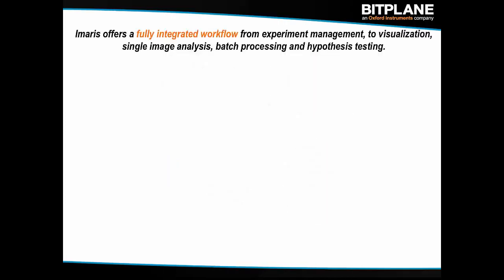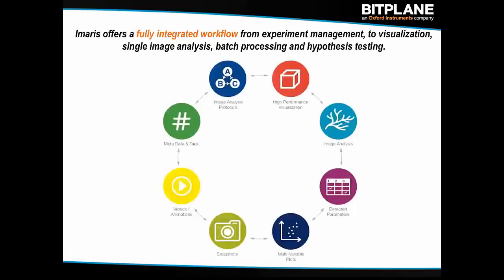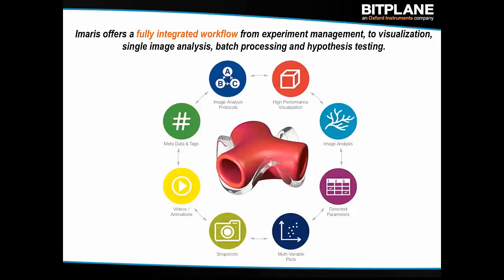So these are the individual items. I mentioned that we have to keep the connections. That's the individual items that we keep track of within the arena view, all the way from metadata to the segmented results and the plots and the videos. All of that is interconnected, and you can pull out at any moment any one piece of information and know where it comes from, know the origin, and be able to see it in 3D space in the context that it lives in.